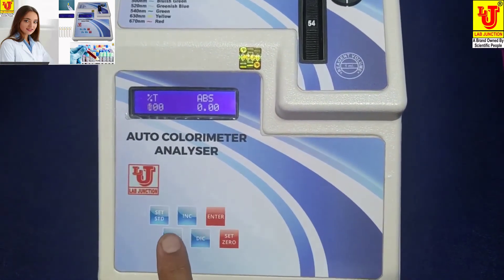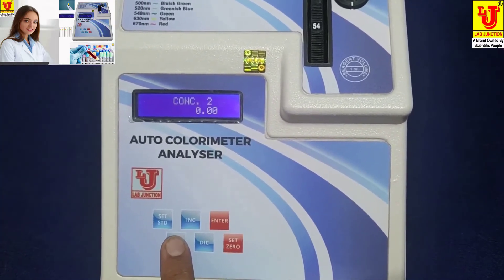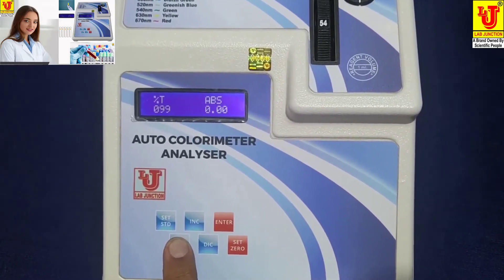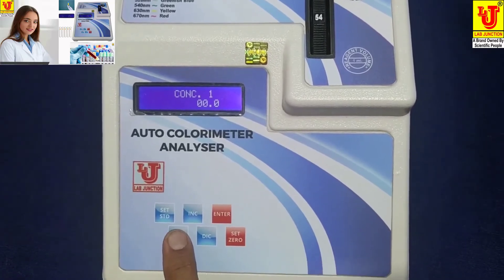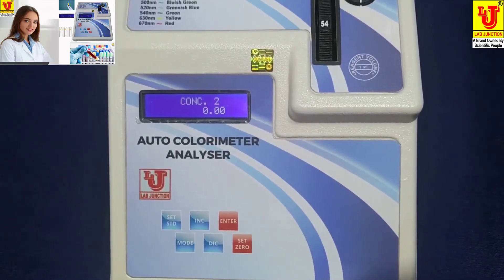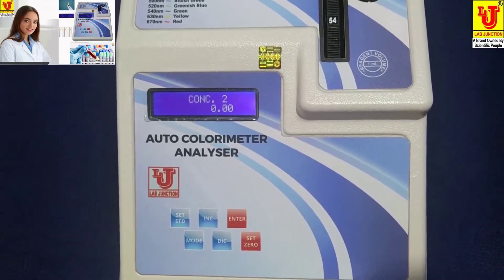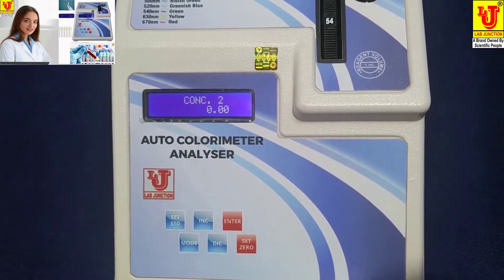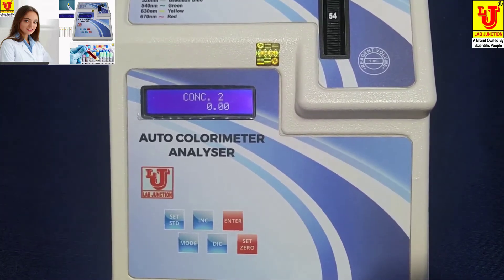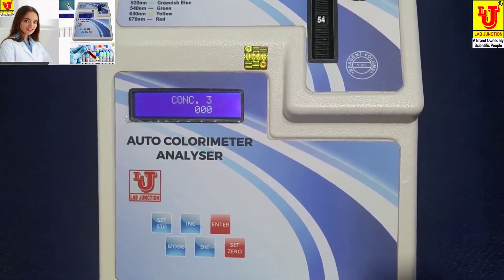If you press the mode key, it shows concentration 1, concentration 2, and concentration 3. Concentration 1 is for hemoglobin. Concentration 2 is for creatinine and other parameters. Concentration 3 is for glucose.